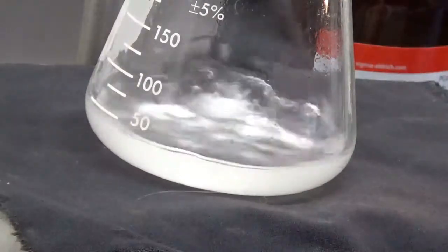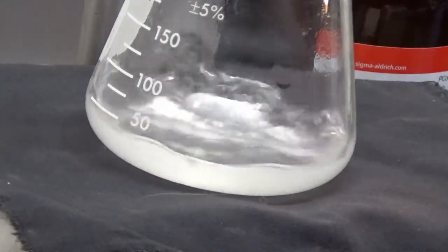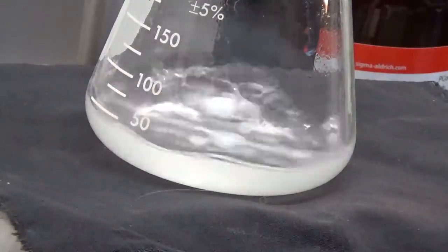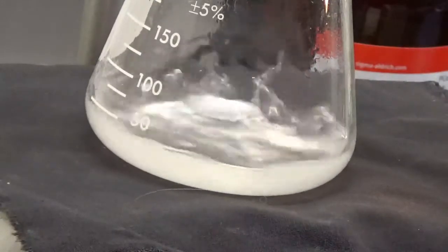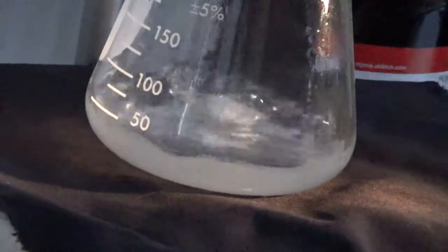I don't even think I'm up to a milliliter yet. Pretty sure it's supposed to be over a milliliter. Yeah, I'm gonna keep going. Well, I don't have to have the light off when I'm putting the drops in. So, 1, 2, 3, 4, 5, about. It still looks kind of cloudy to me.